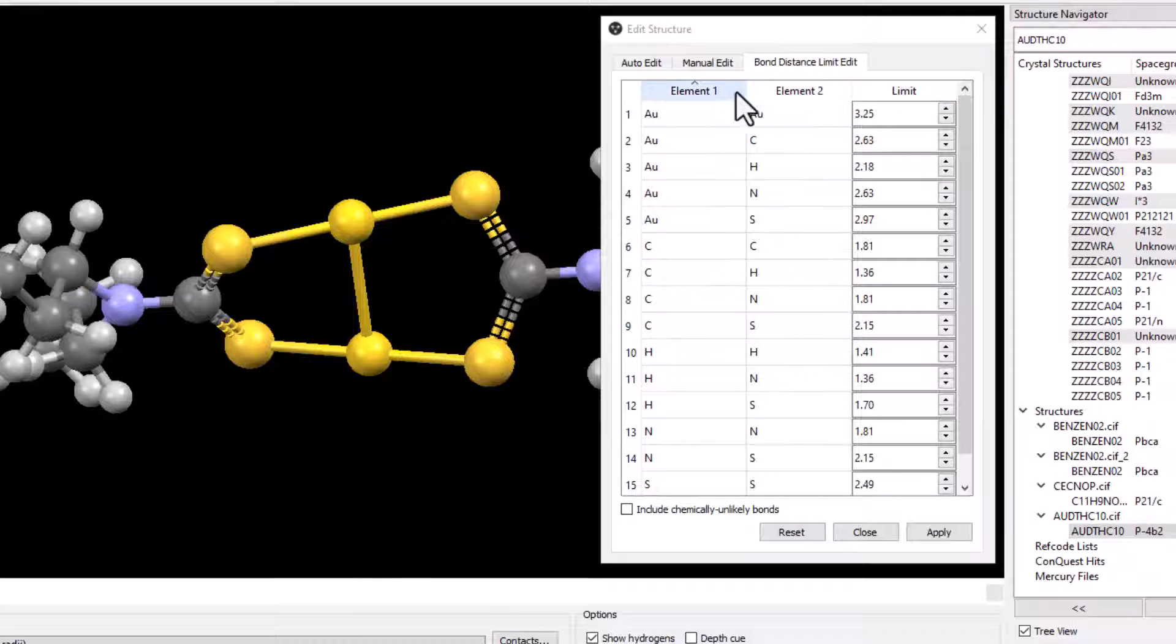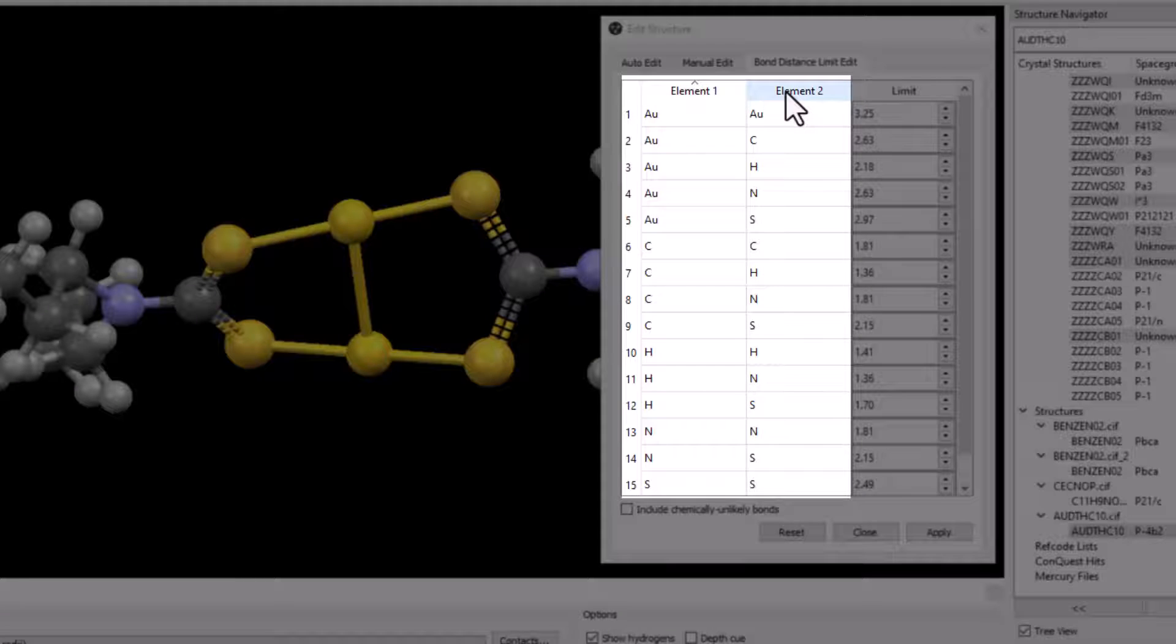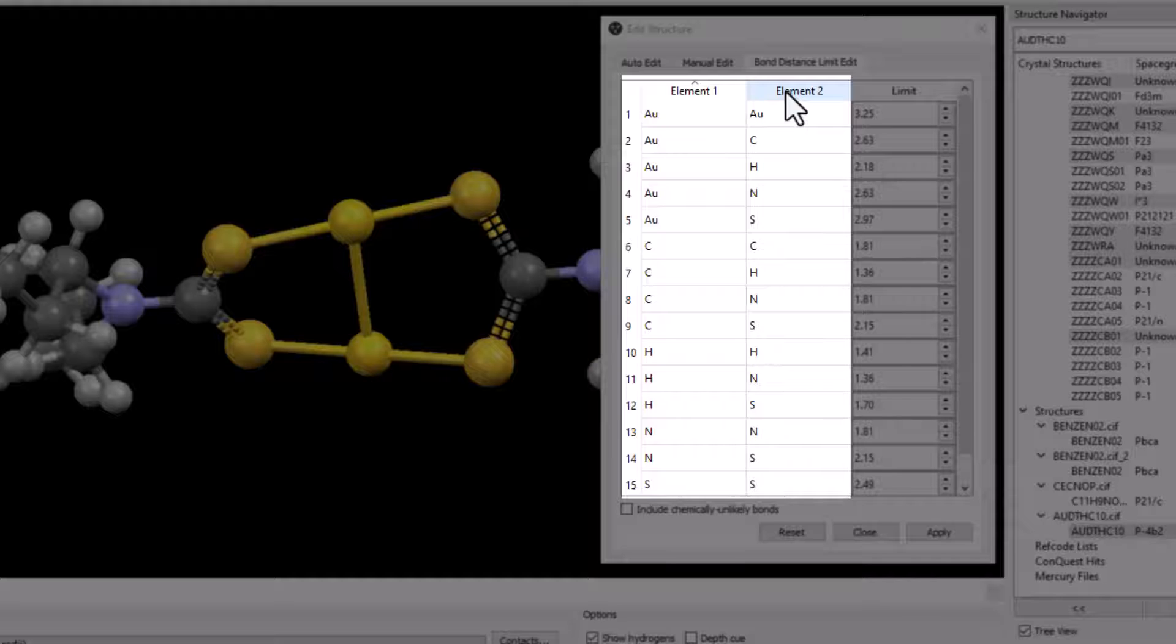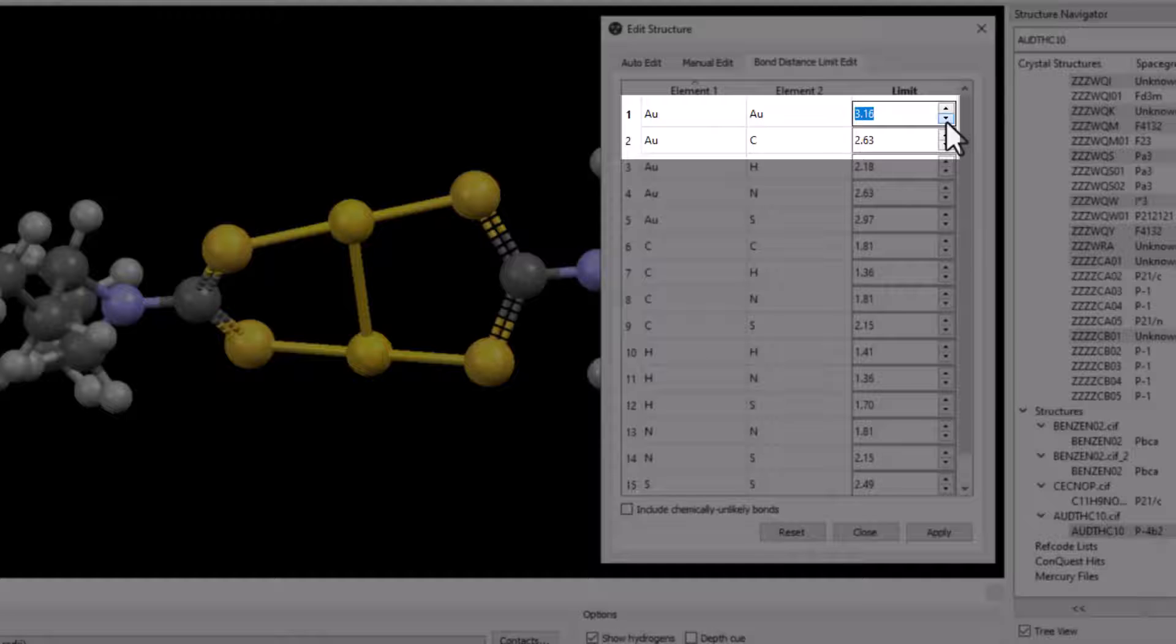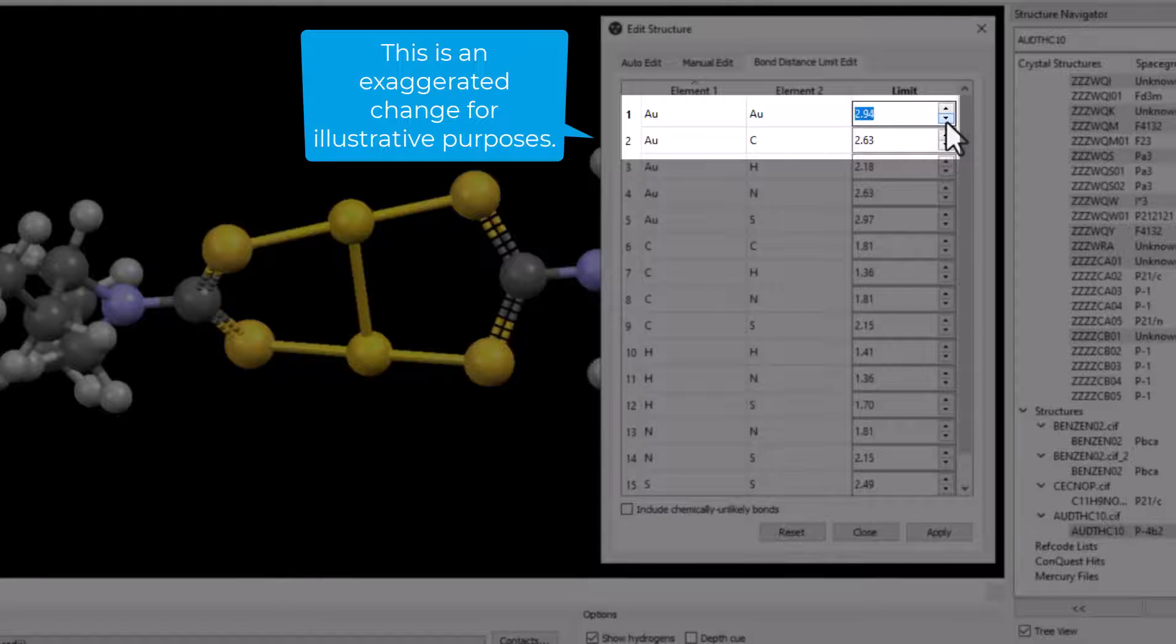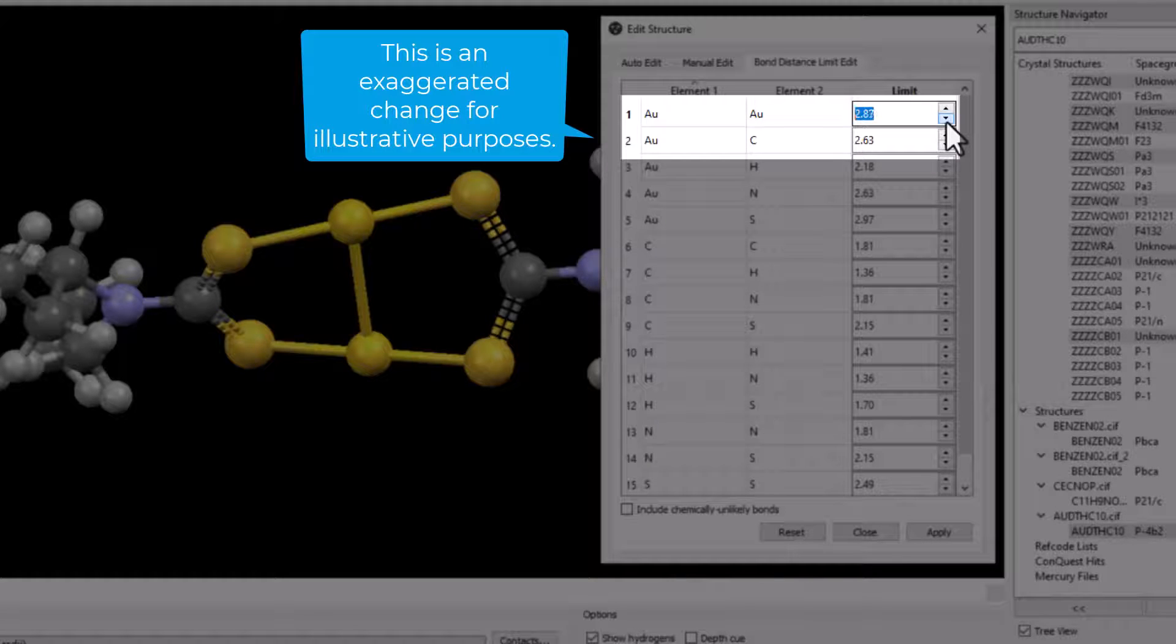The elements in the element 1 and 2 columns signify the bonds between two atom types within a structure. We will change the limit of the AUAU bond. Set the limit of the AUAU bond to 2.75.